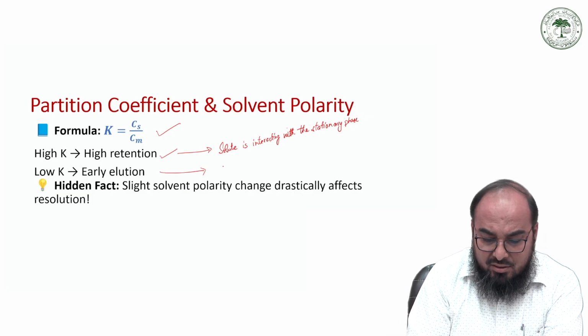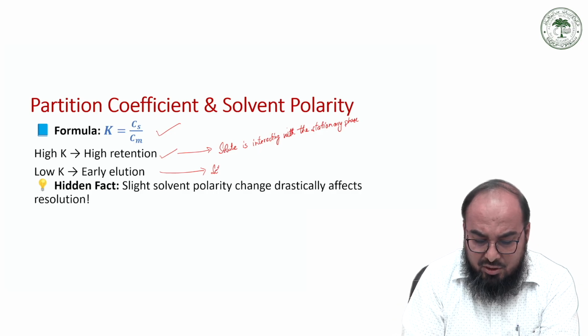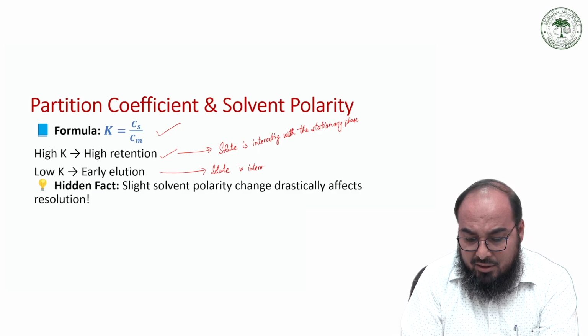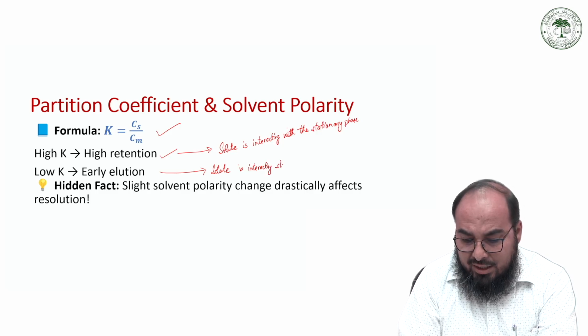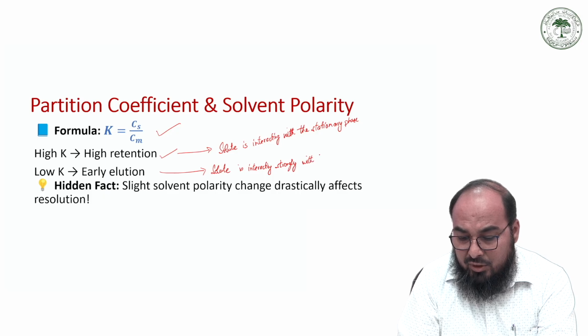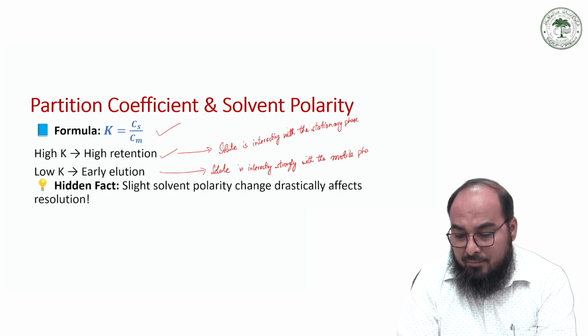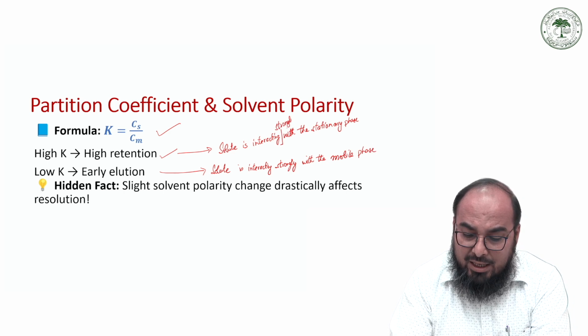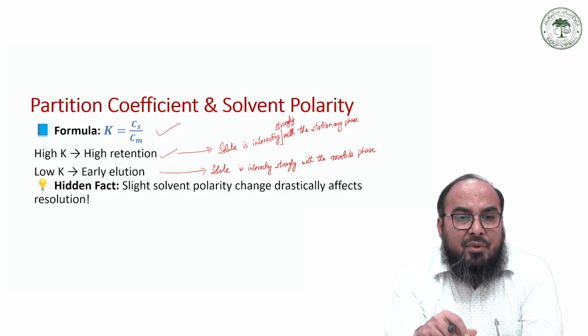Early elution means the solute is interacting strongly with the mobile phase.